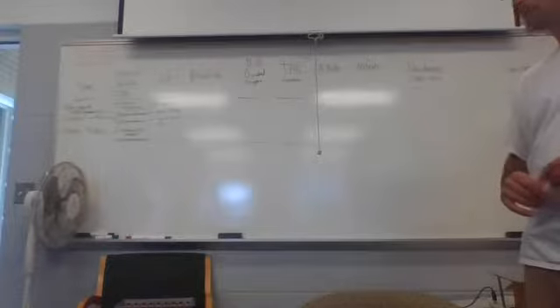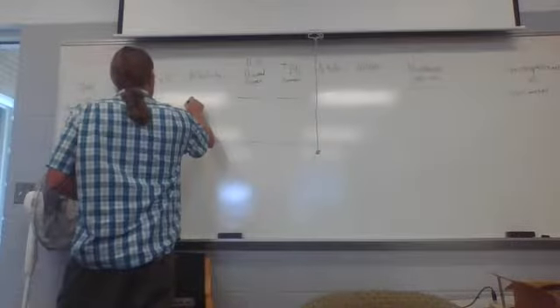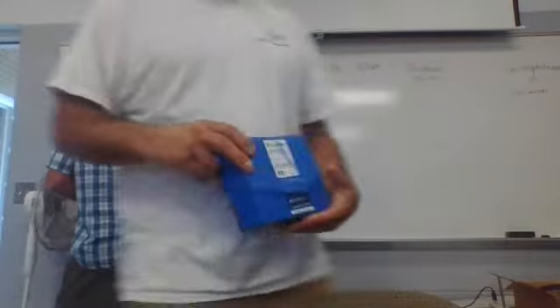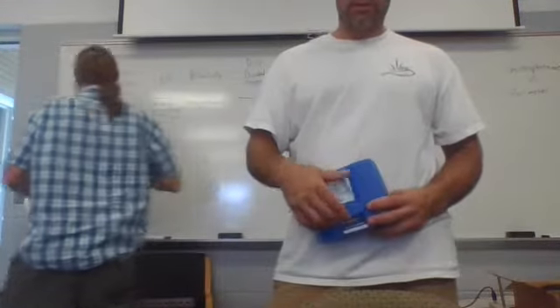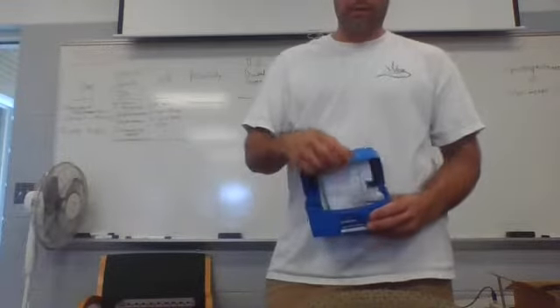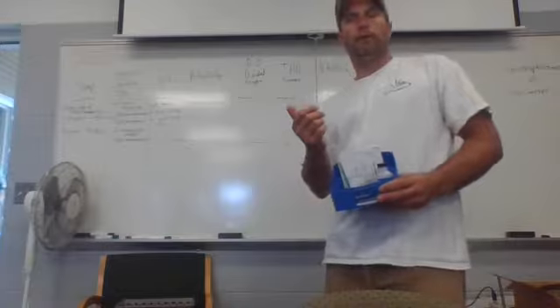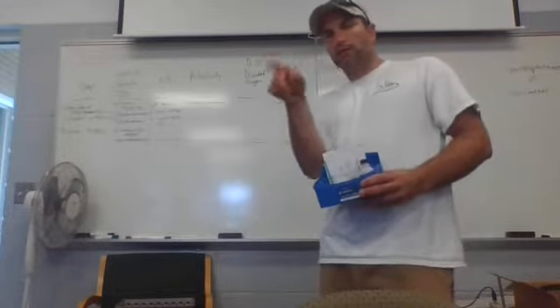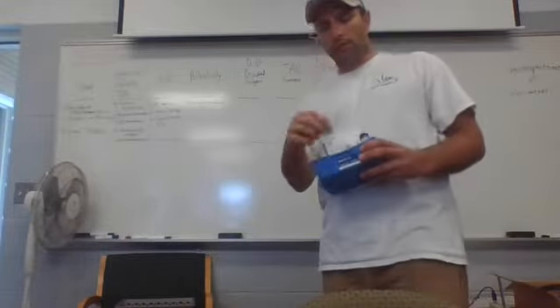All right, alkalinity. Titrations. The primary way of measuring alkalinity is with titration. There's different types of titrators. A lot of what we have is LaMotte brand. There's also Hach, H-A-C-H, another brand of test kits. Their alkalinity is a digital titrator. It's got a little knob that squirts out a little bit of acid at a time until you see that color change, and then it'll just give you a number.